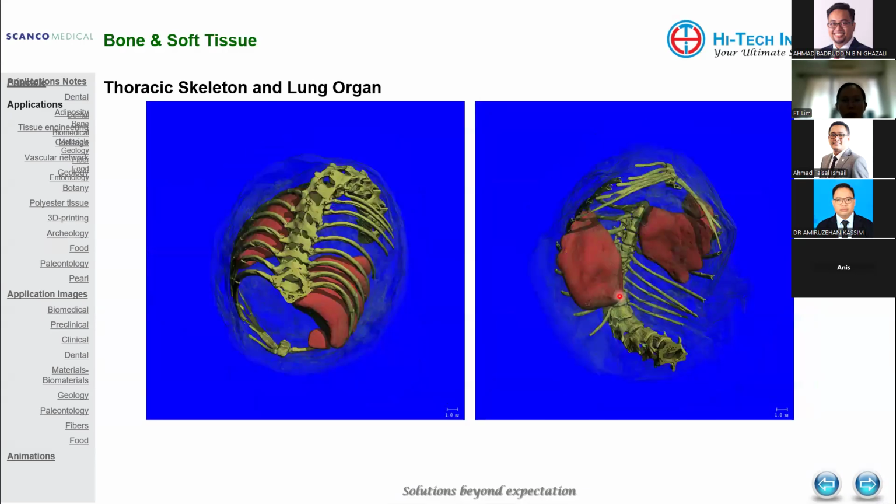Okay. So we can also look at lung. MicroCT can be divided into ex vivo, and there are setups specifically designed for in vivo, which I didn't cover today. Just for sharing, for in vivo designs, they have software to calculate, because when you're trying to capture the image from a live animal that is breathing, you can see that the lung is expanding, shrinking, expanding, shrinking.